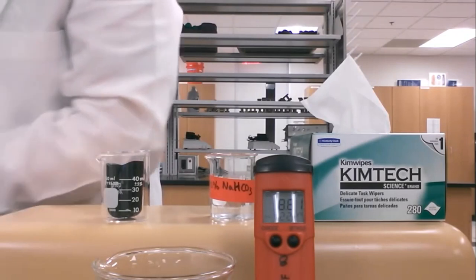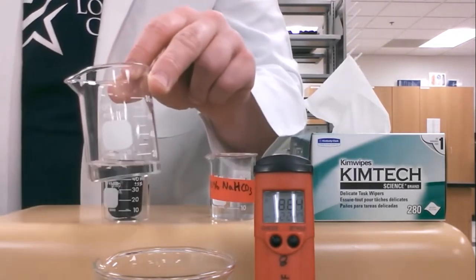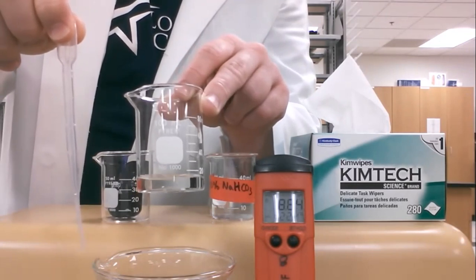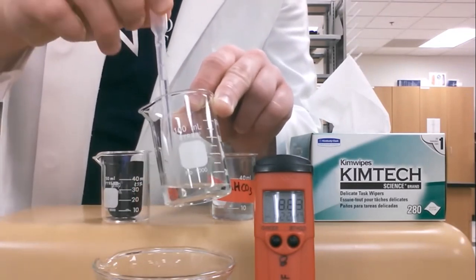And we're going to pour some into a beaker, just a little bit. And after we've poured some into a beaker, we can take our plastic disposable pipette or dropper and we can suck some up.